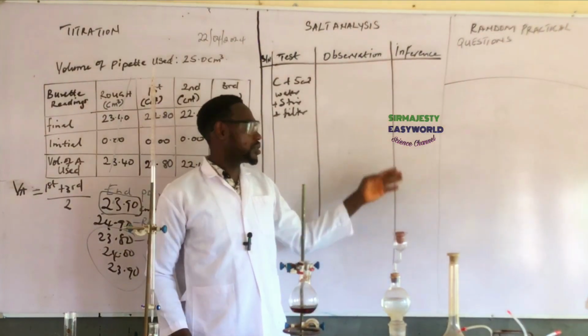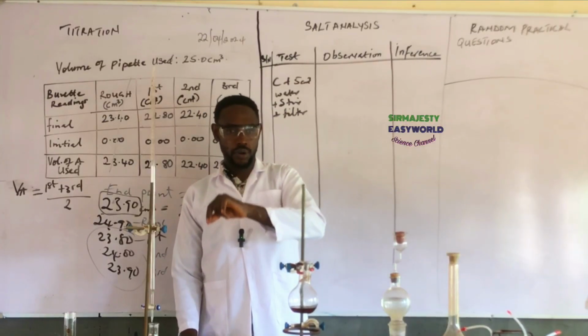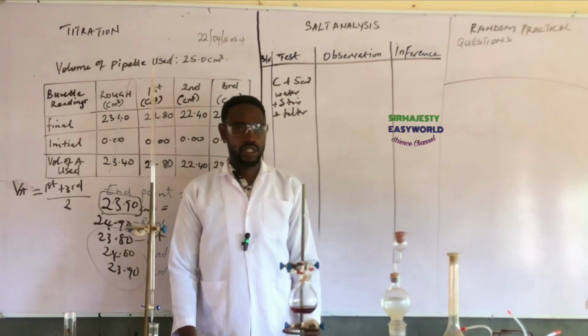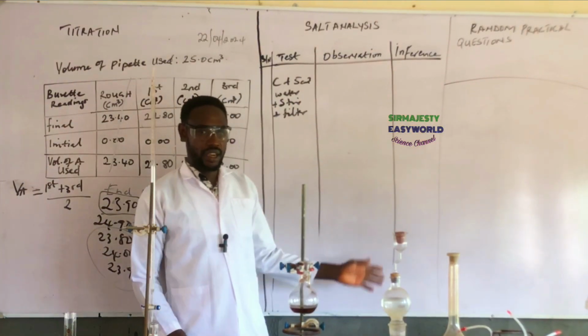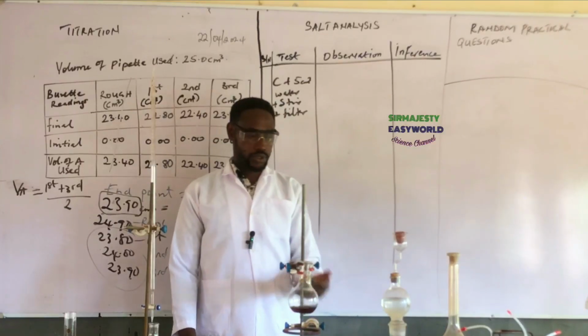So gelatinous, then in excess, you are checking if the precipitate formed, that insoluble particle, you have seen the color and the nature, whether it dissolved or not, okay? So endeavor to watch the videos here on test for all the cations and possibly the anions, of course, with the basic reagent. And then you should know the action of litmus paper on some solutions.